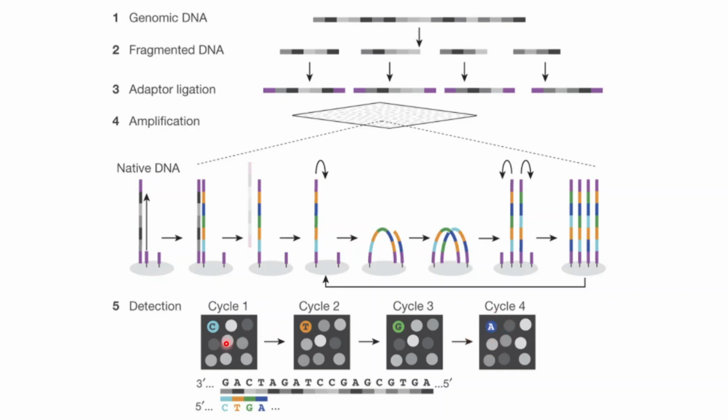So based on the signal that is generated in an orderly manner when the base is added, you can actually sequence it out. Basically, first it gives a light blue signal, meaning that it is adding a C, then an orange signal comes up, it is adding a T, and then G is added, so it gives a green signal, and when A is added, a strong or deep blue signal comes out.